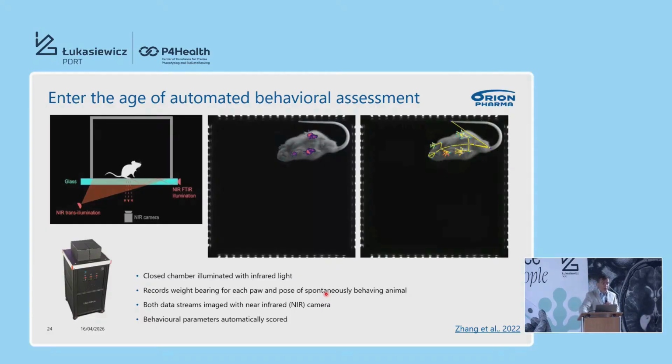And then by using machine learning and computer image analysis, without any labeling of the animal as such, we can automatically extract positions of limbs and body posture, and then quantify this, whether in our wild-type animals or in animals where pain has been induced.